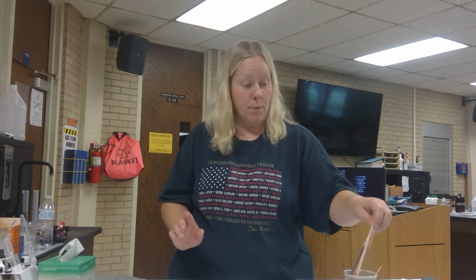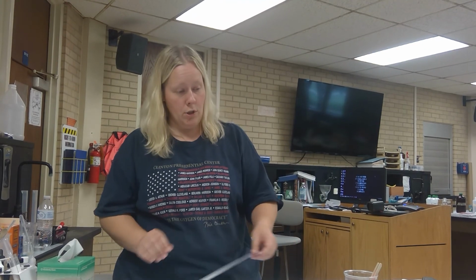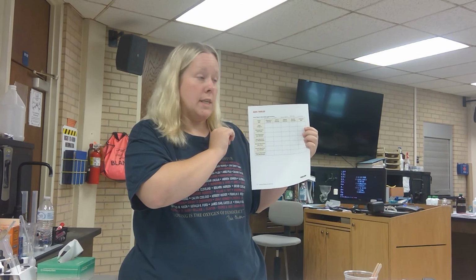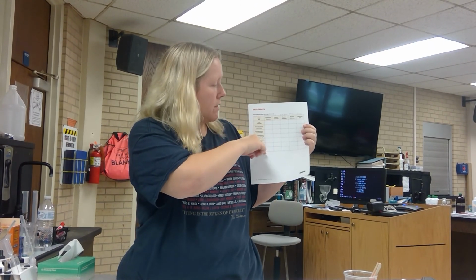All right. So I'm going to have these sticks cut up into 4 pieces, and one thing you can do while you're letting your pieces of wood sit, to help keep myself organized, I went ahead and labeled what color was what stick. So purple color was potassium chloride, red was lithium chloride. This just made it a little bit easier for when I get to that point. But when we come back, I will have let these have a chance to sit in water, and we will be ready to flame test. So come back and we'll see you shortly.